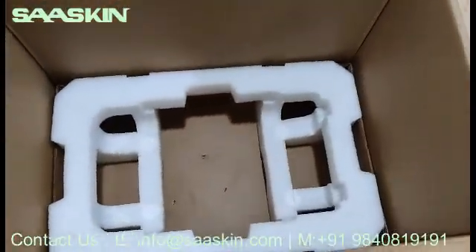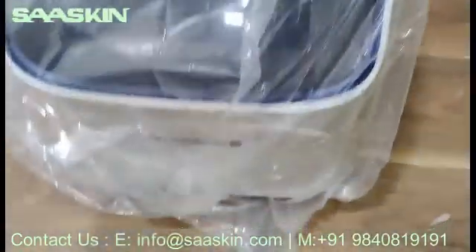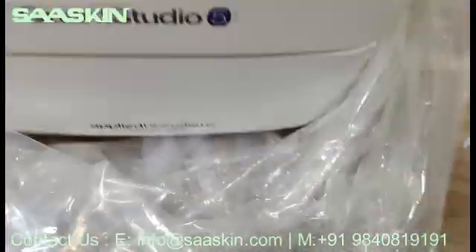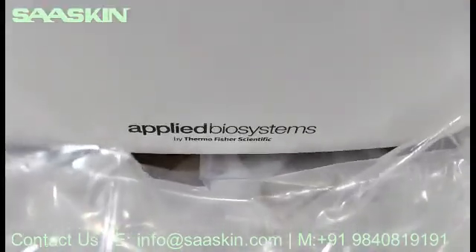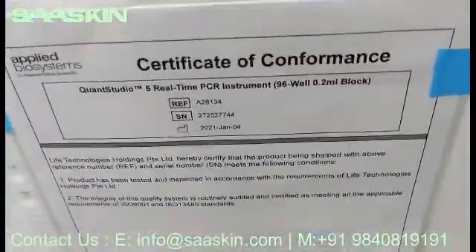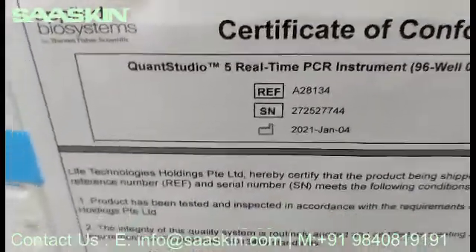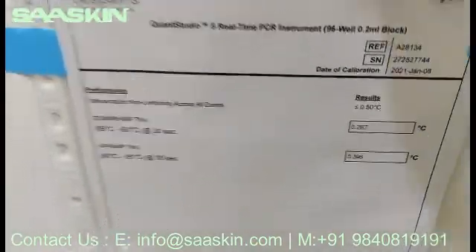This is the inside — you can see a very good base support is given. I'll show you the instrument. Here is the instrument. You can see the other side of the instrument. You can see the certificate of conformance of this QuantStudio 5 real-time PCR instrument, 96-well, 0.2 ml block. This is the part number. And also you can see the certificate of analysis has been given as part of this instrument.